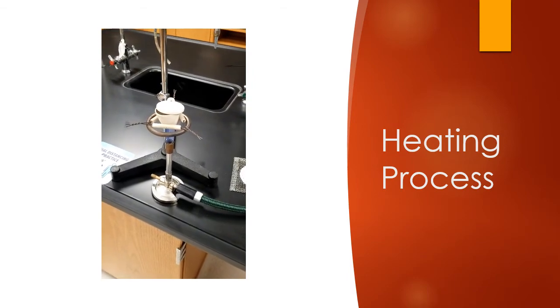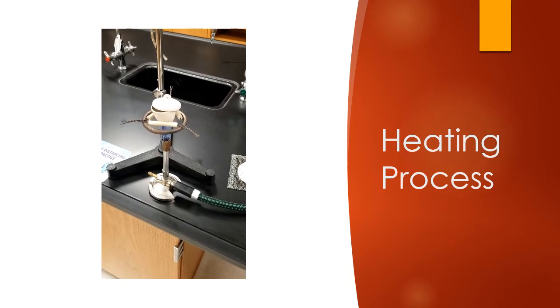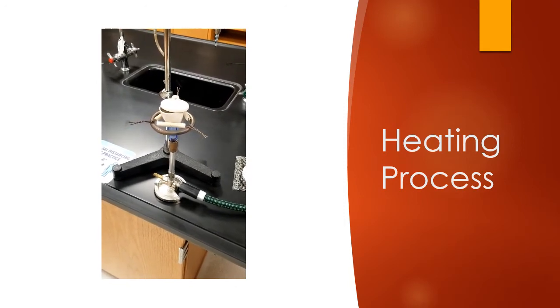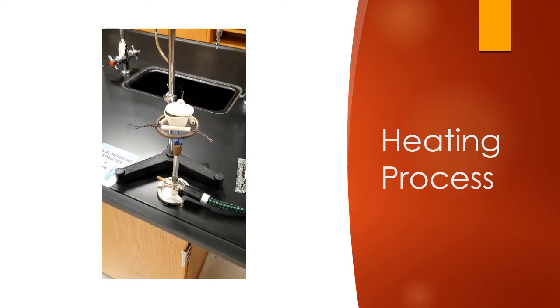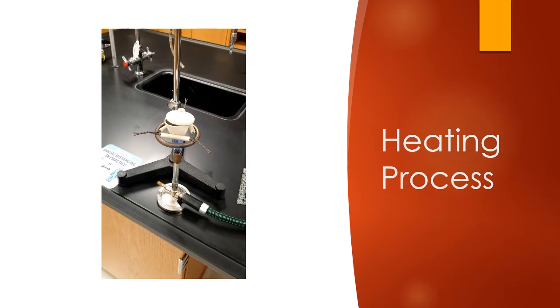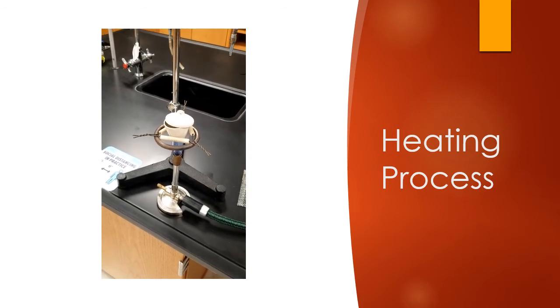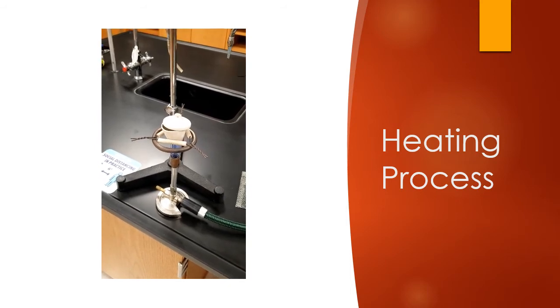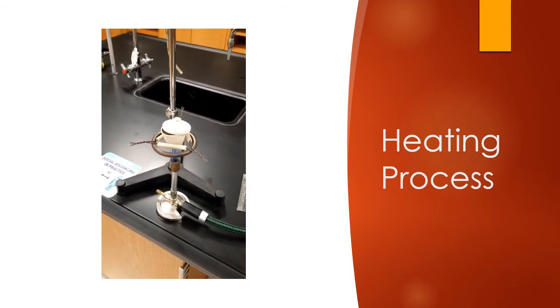So here we are heating up the hydrate. We're trying to drive the water out of those crystals. You can see we have the crucible cover on top of the crucible, but with a slight gap. That's to allow the water vapors out. We need the crucible cover on because the water is trapped inside of those crystals.